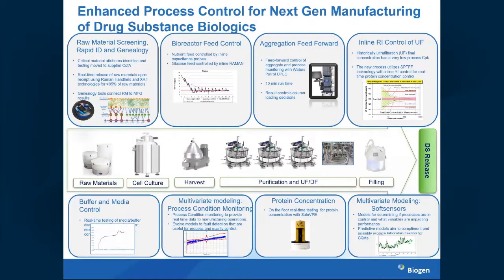And clearly there are a number of other techniques. I'll show that as well in terms of bioreactors: what tools we are using for looking at performance of reactors, being able to monitor growth rates and so on. So this is just an overall snapshot of what is in the new facility coming up and how the other facilities are adapting as well.